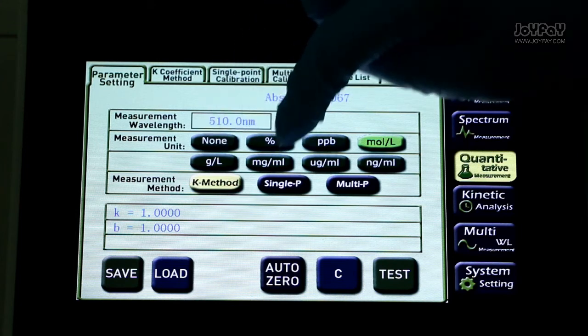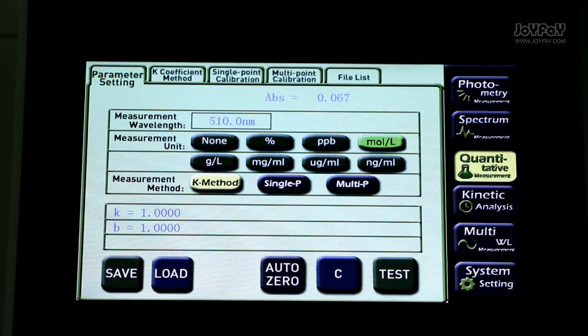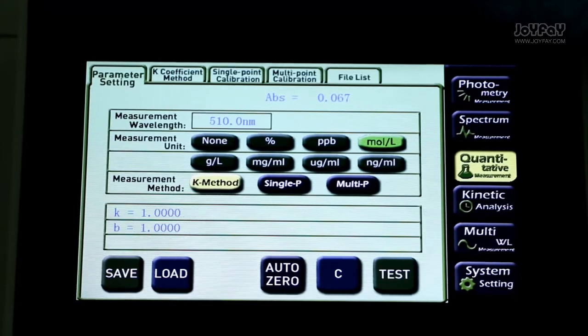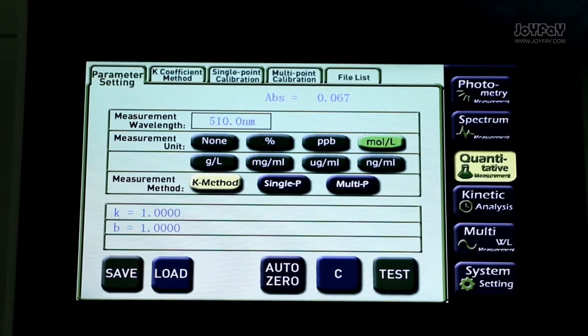There are eight measurement units and three measurement methods for you to choose. Different measurement methods need different values in the blank box at the bottom.